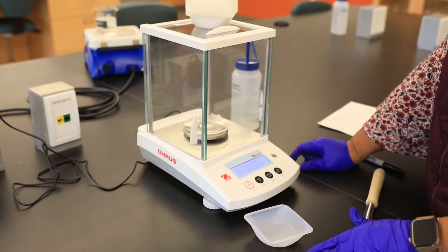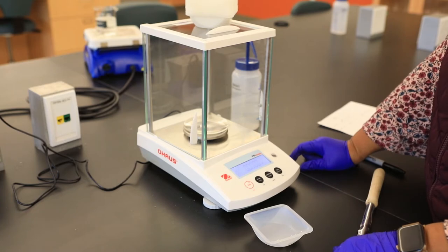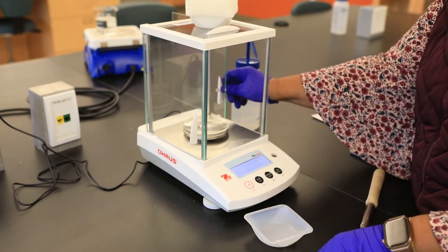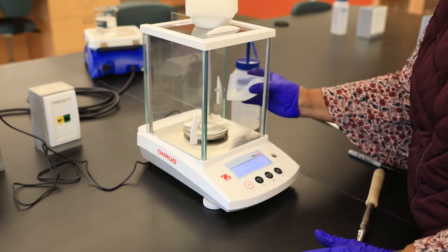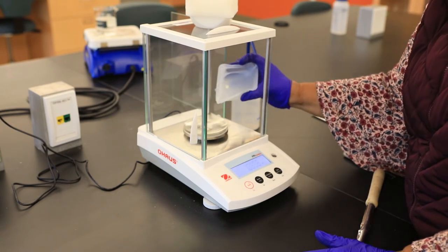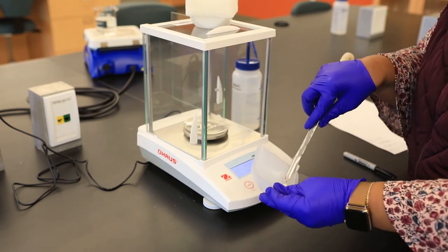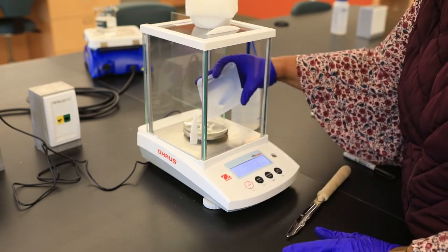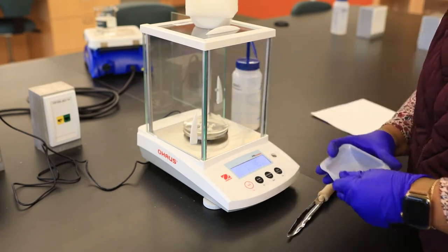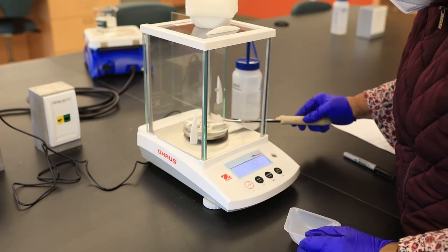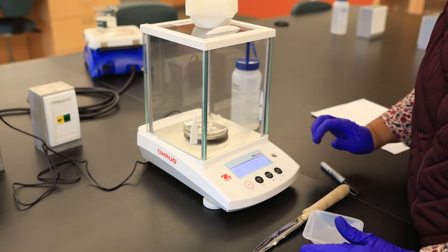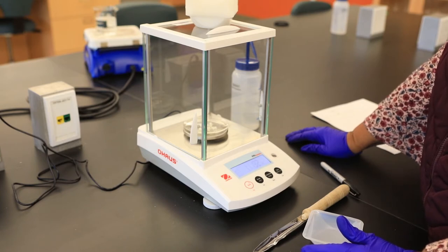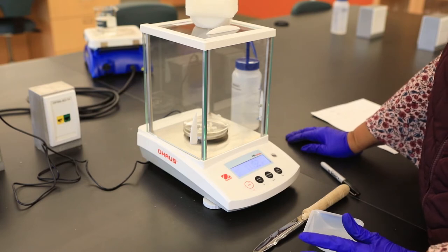The goal in this section is to determine the exact mass of casein that was extracted from the dry milk. I have zeroed or tared the balance with our watch glass. Now I'm going to add the casein, which is almost dry. Based on this, we have isolated 1.119 grams of casein.